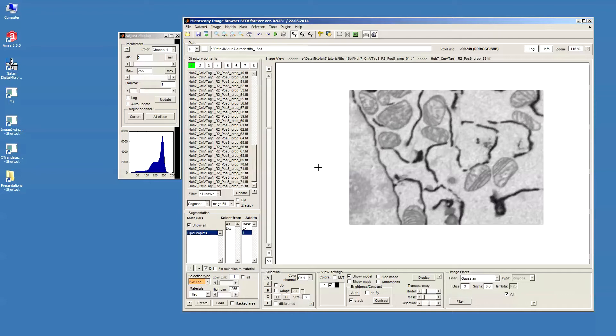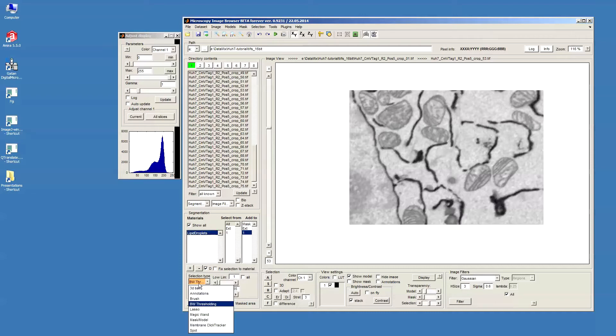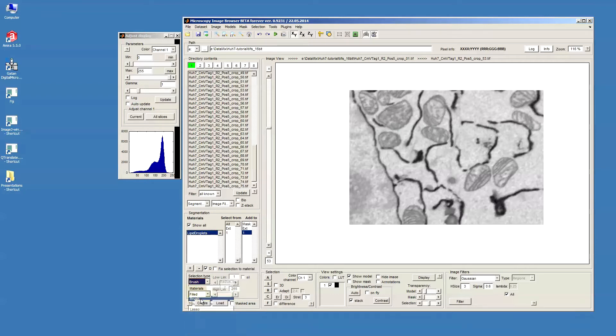There are a few droplets in this dataset and probably the best way to segment those manually using the brush tool. In order to select brush I should go to the selection type and then choose brush.